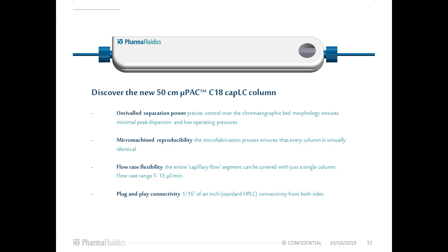This closes my part of the webinar covering the µPAC column technology. I am very pleased now to hand over the floor to Koen Sandra from the Research Institute for Chromatography, who will share his experience about working with our µPAC columns to analyze host cell proteins.